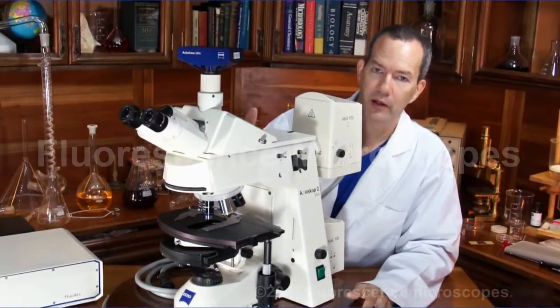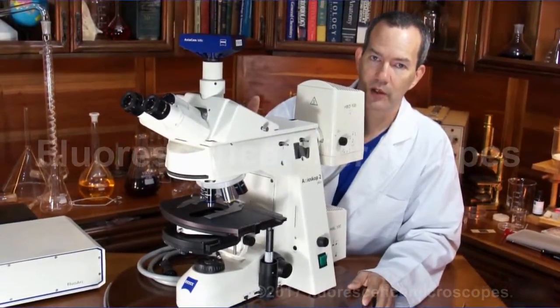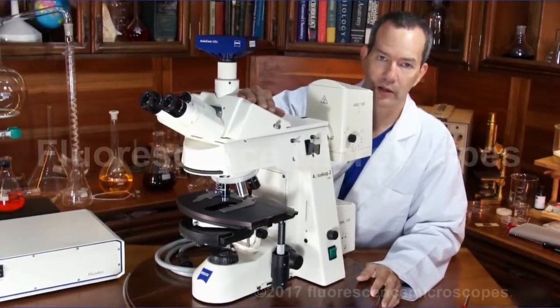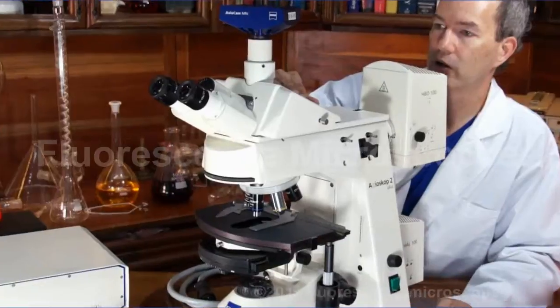This is a Zeiss Upright Axial Scope 2 Plus Microscope. We've configured this microscope with a better head. This head is about a $4,000 head.